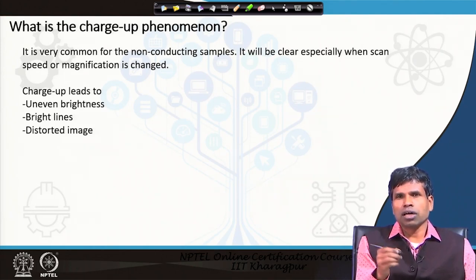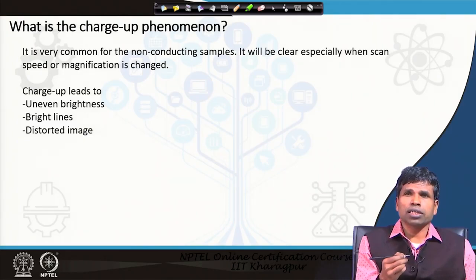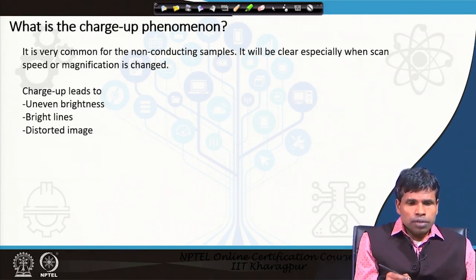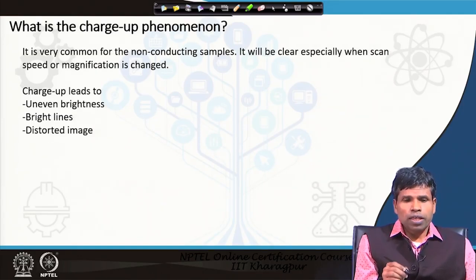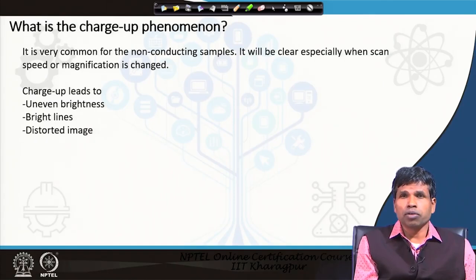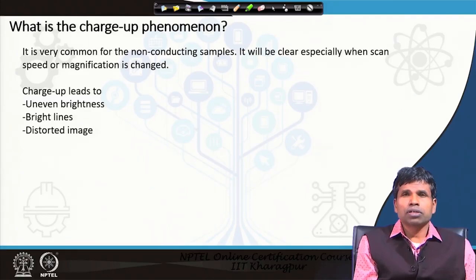When we go for a slower scan rate, our signal-to-noise ratio will be much improved and we will get a much higher secondary and backscattered electron yield, giving us the best resolution or highest signal. Similarly, when magnification is changed and the sample is non-conducting, you will see distortion in the image. This charging up leads to uneven brightness — you may see bright lines or a distorted image. These are the outcomes when the sample is not conducting and charge builds up at the surface.